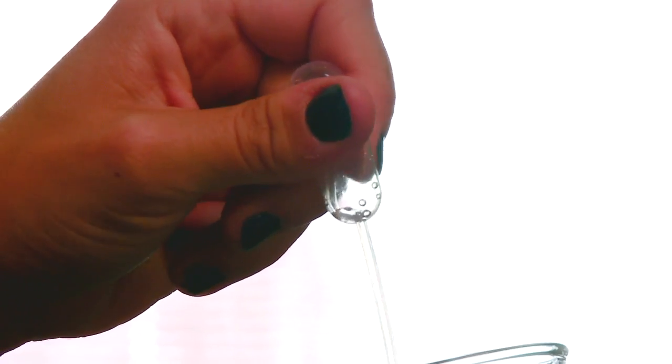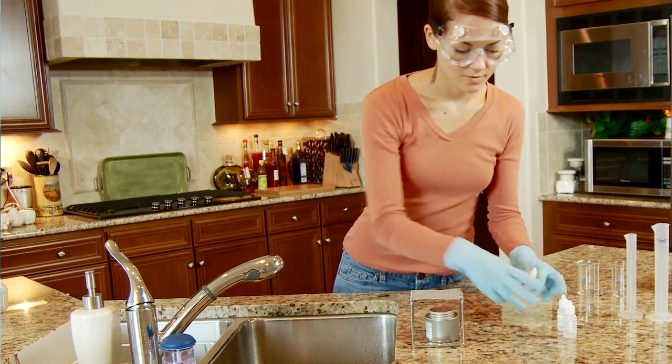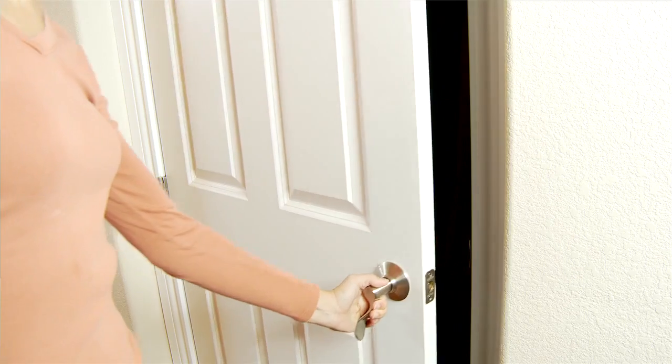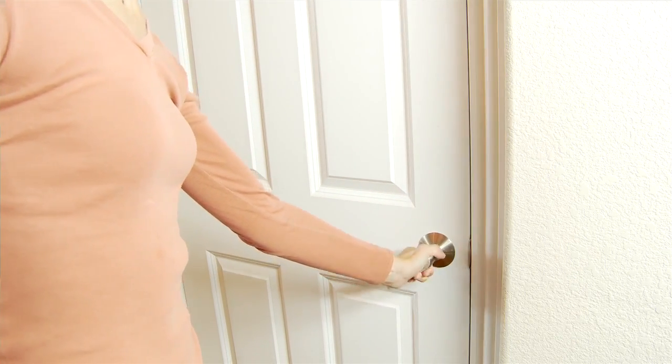Clean pipettes by drawing up and expelling distilled water several times. Then, while squeezing the bulb, forcefully swing them in a downward arc. Double check that all materials have been properly cleaned and put away. Store your lab out of reach of children and pets.